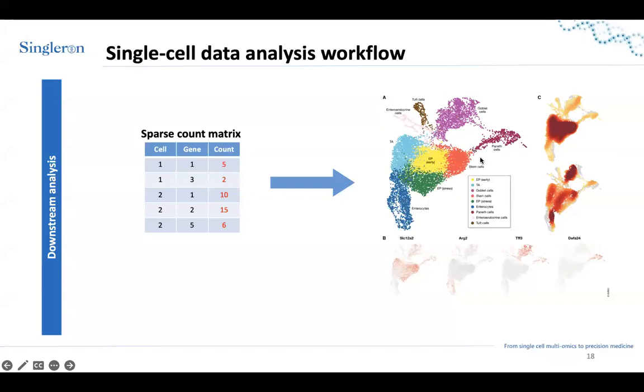So here you have 2 sample data together. And if you plot them for the individual samples, you see that from sample 1, most of the cells are actually in this region. They're coming from this region. You see here, it shows the cell density for sample 1.